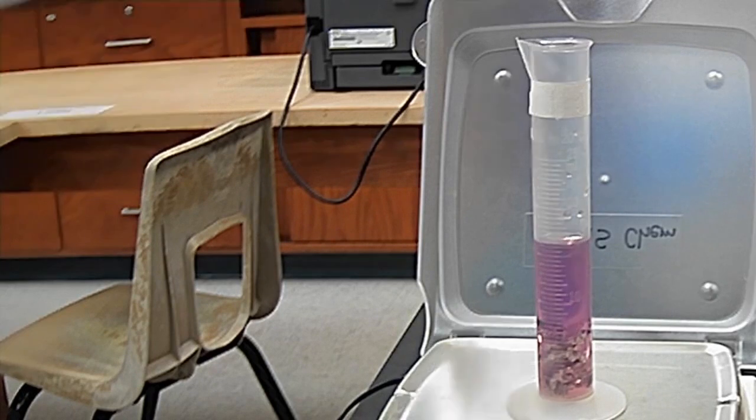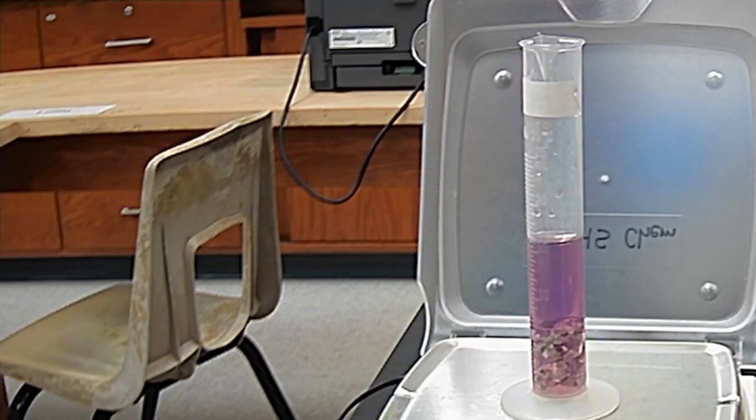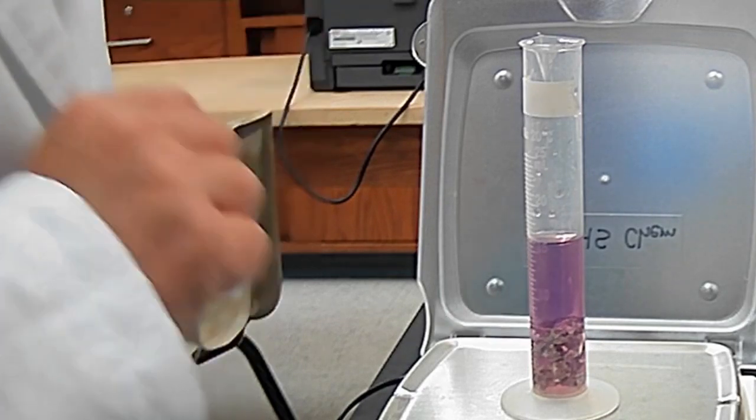Our new volume is going to be, should have brought my reading glasses. There we go. It's going to be about 15.7. So 15.7 milliliters is going to be our new volume. This is trial 1, metal B.